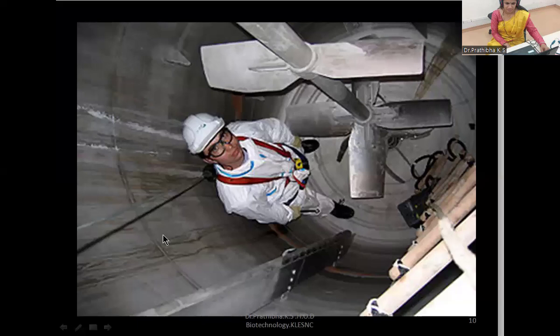Okay, this is the huge fermenter vessel. Very good to see here. These are the baffles which are present on the wall of the bioreactor. And here you can make out these are the blades, which we call the impellers, for the mixing of the media. Large bio industries will have this. There we usually find such a big device, that is, the impellers.